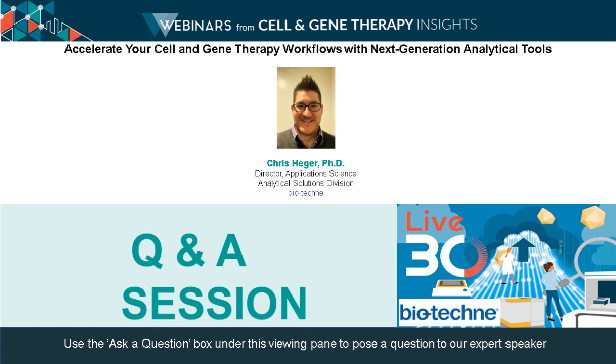Great, thank you. And I think we've got time for one more quick question. Which instrument is preferred for full empty analysis?